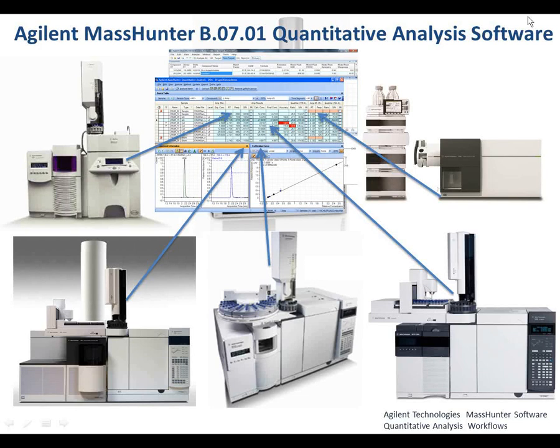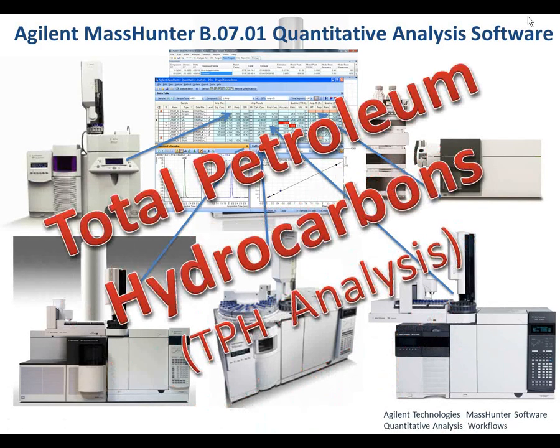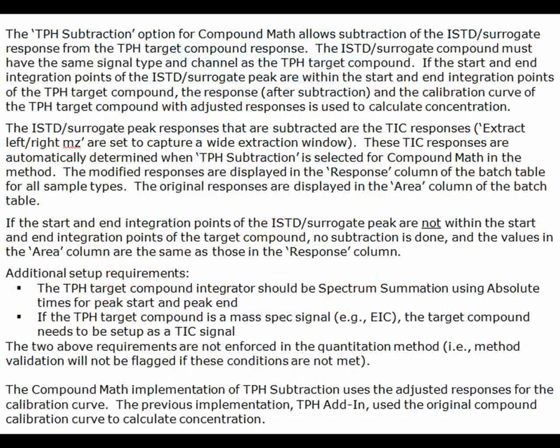Welcome to a discussion of total petroleum hydrocarbons, often abbreviated TPH. Alright, let me walk you through the TPH subtraction option for compound math. There is another section which discusses compound math in detail, but in this application it subtracts the ISTD or the surrogate response from this TPH target compound response.